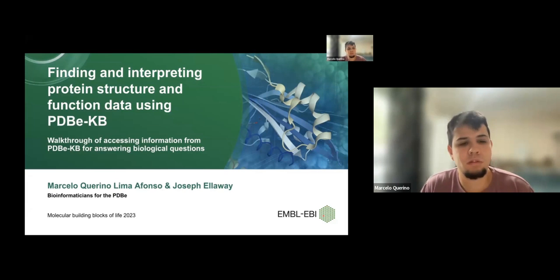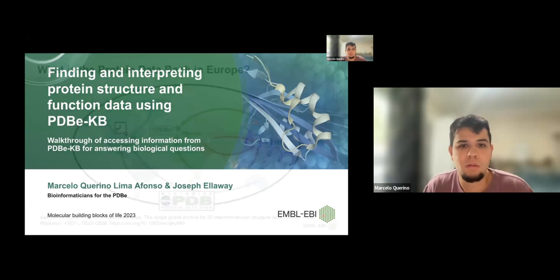So first I'll do an introduction. As he mentioned, I'm Marcelo, and then Joseph will join doing a walkthrough. And today we are going to talk about finding and interpreting protein structure and function data using PDBe KB. And we also have, as I mentioned, a walkthrough of how to access information from KB to answer biological questions.